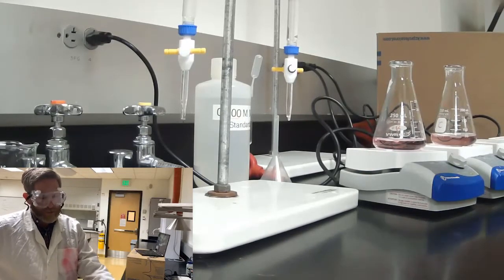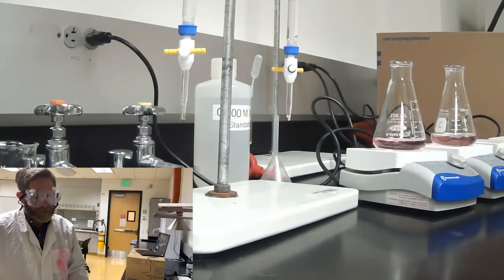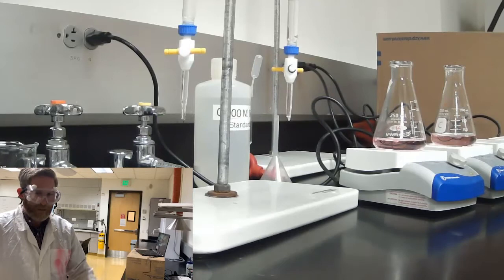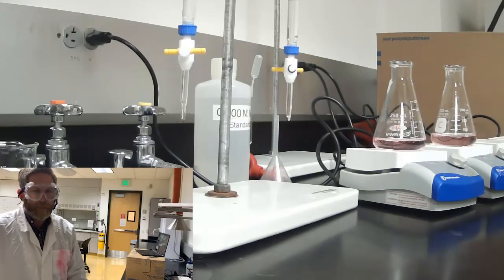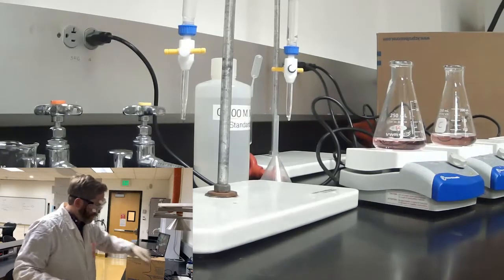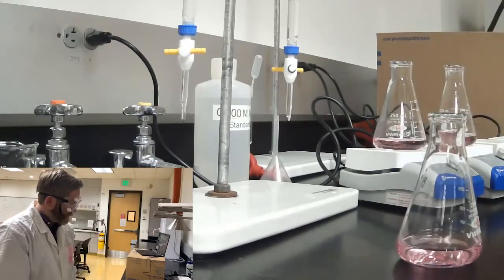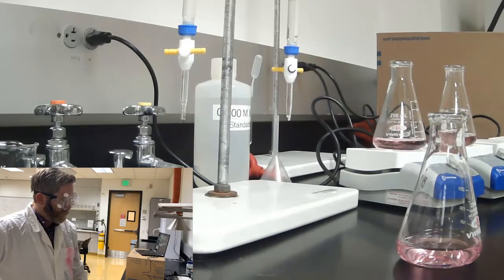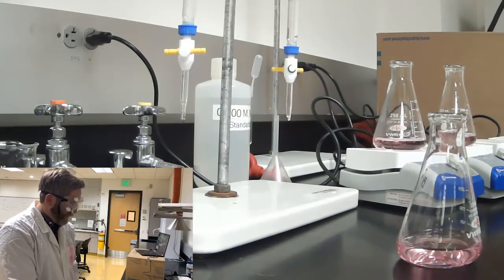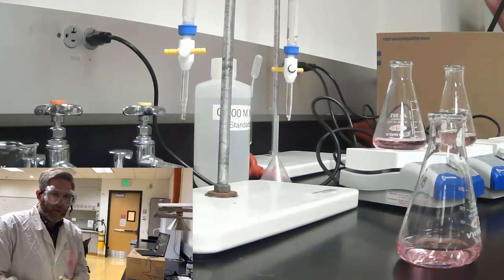We want to make sure as they are warmed that they also don't change to yellow, because that will again indicate that we have neutralized all the acid and there won't be anything to titrate. So while we have those boiling, we're going to go ahead and set up the antacid, which is done the same way. Before we measure, again, I have these Erlenmeyer flasks. As stated before, we've measured by pipetting 50 mL of our simulated 0.100 molar hydrochloric acid, stomach acid, and we've added our indicator. So next we're going to go measure some of our Tums into this, and then we will continue.